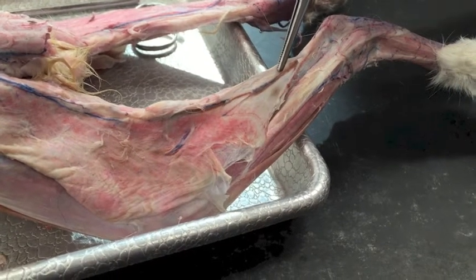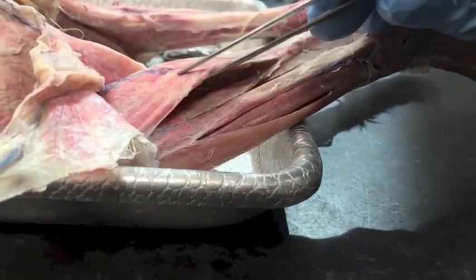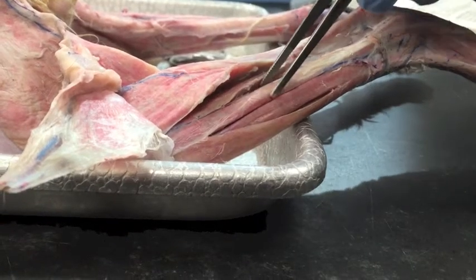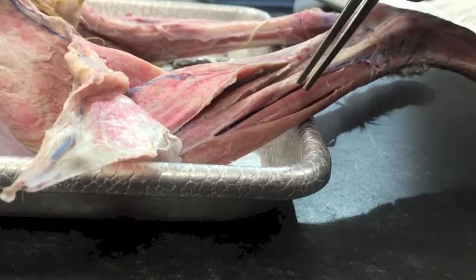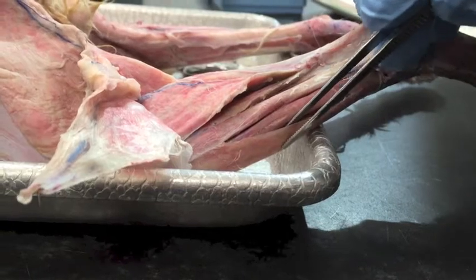This is the biceps femoris, gastrocnemius, the soleus, peroneus longus, the extensor digitorum longus, and the tibialis anterior.